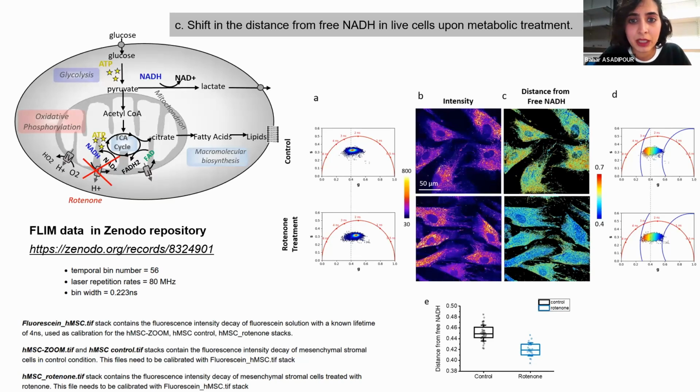Hi. For FLIM analysis, for the moment I'm not sure, but this is something that we can take into account for later, for sure. I don't know if Kiara has more comments to add, or maybe you can address something that I missed in the chat.